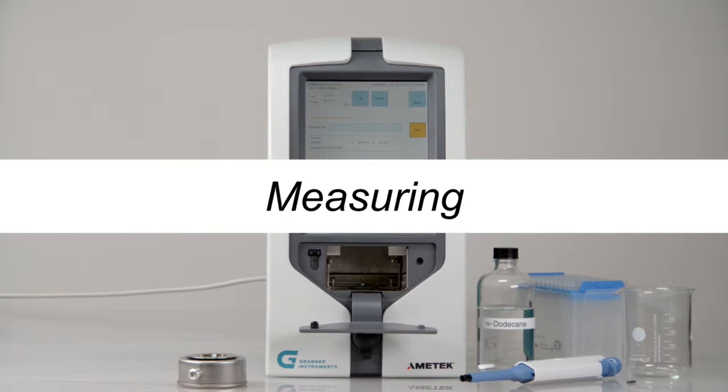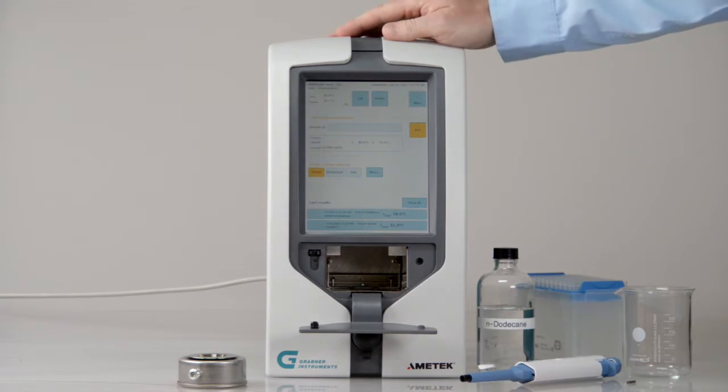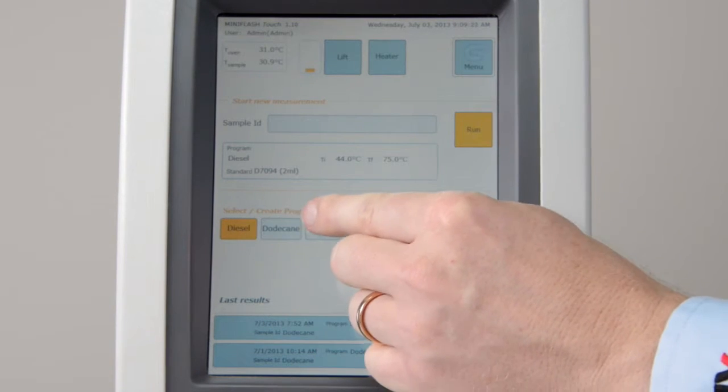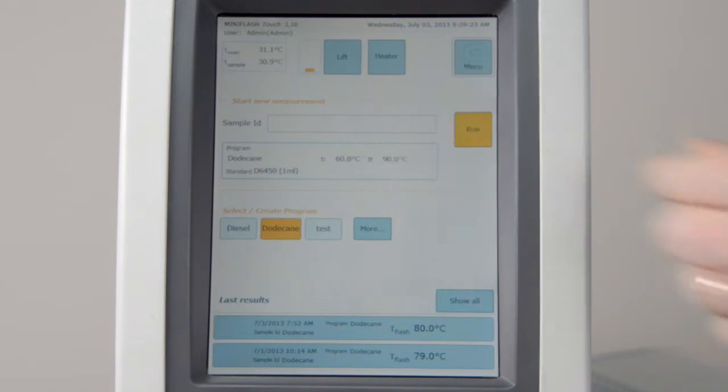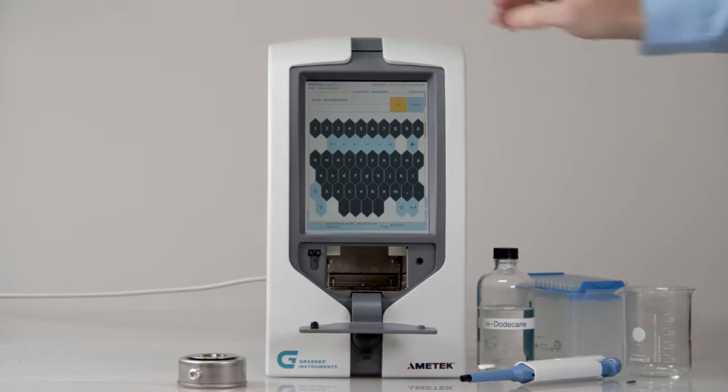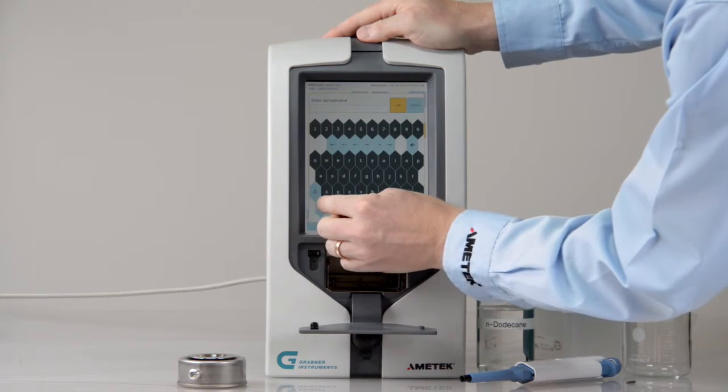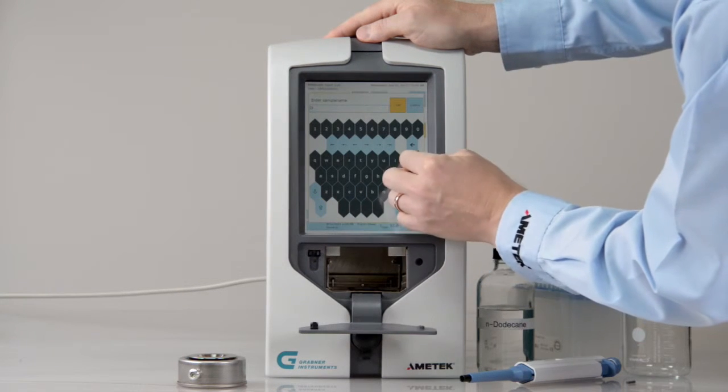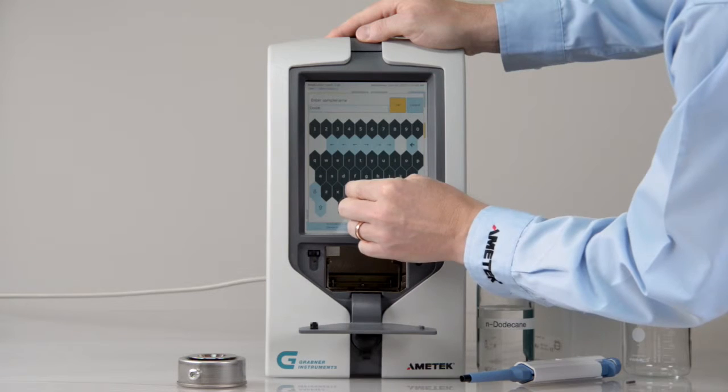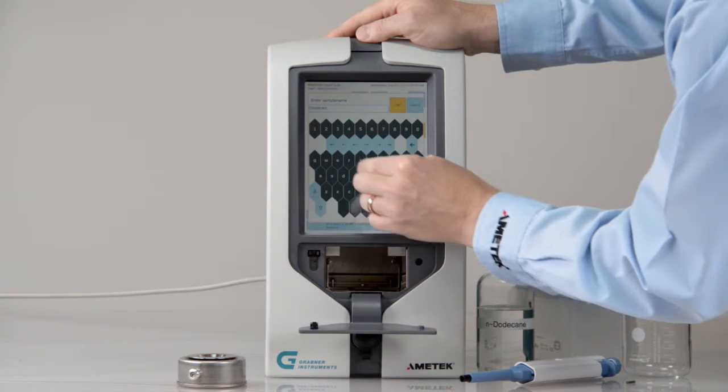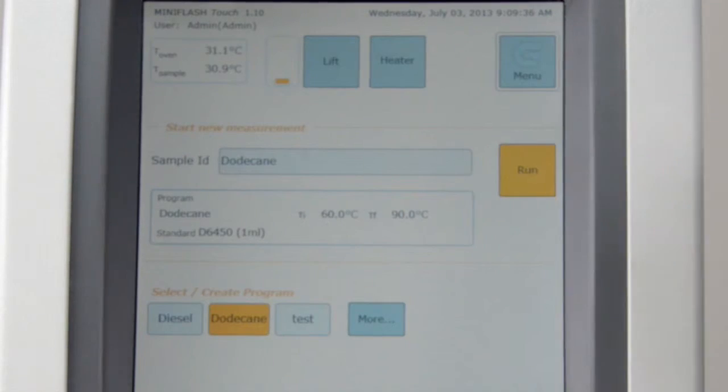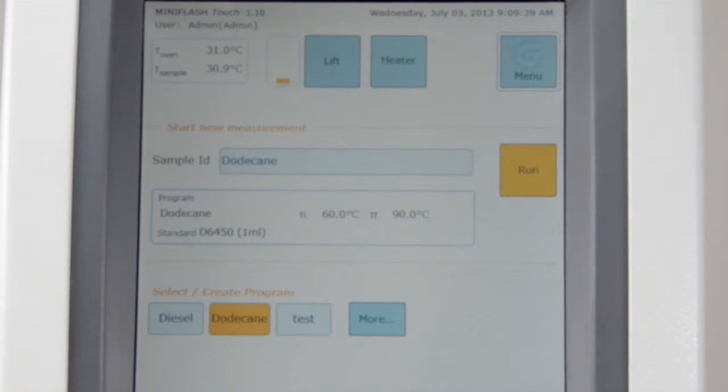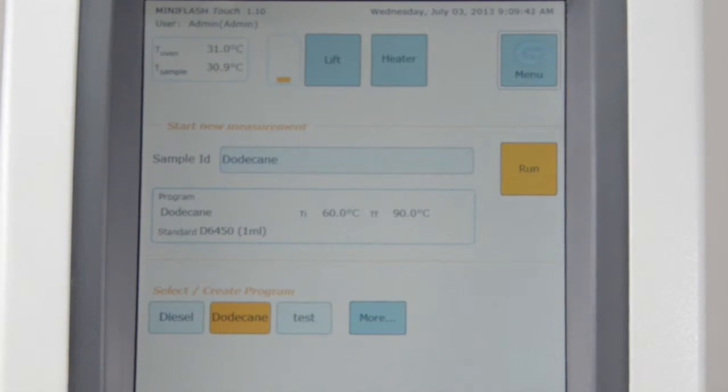Measuring. Please select the Dodecane program from the three recently used measurement programs. Dodecane is a CRM standard used for quality control. Enter a sample ID. A virtual keyboard will pop up and allows you to enter a sample name. Program name and program details are shown below the sample ID field.